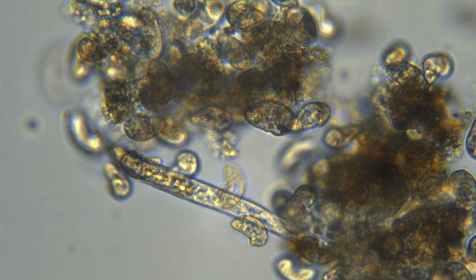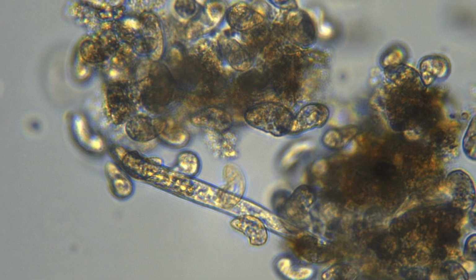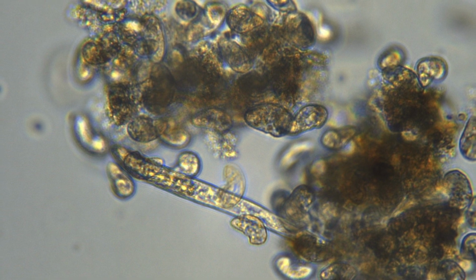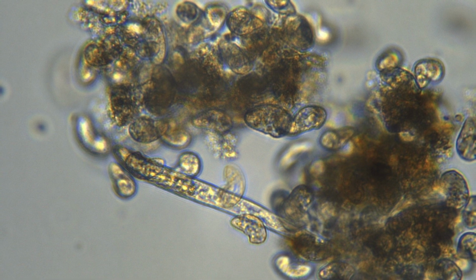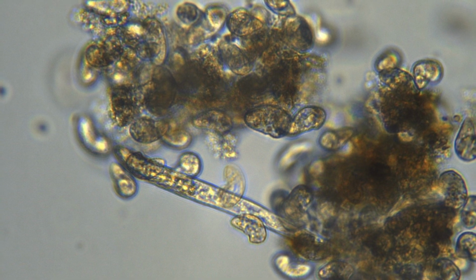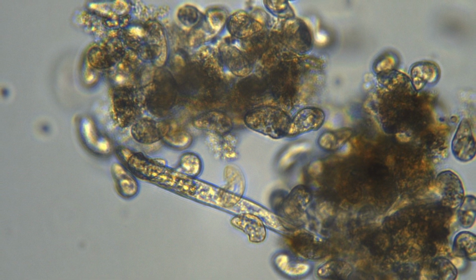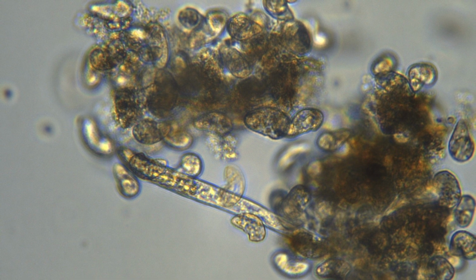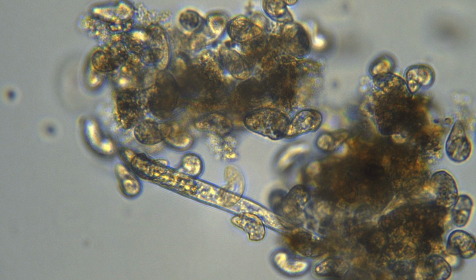Next up is my 4th photo. A lot sharper, really cool photo this. Again, what sticks out are the lightish brown clumps of organic matter, and this illustrates amazingly well how that organic matter really forms the starting block for other organisms to live, function, and do things in the soil.